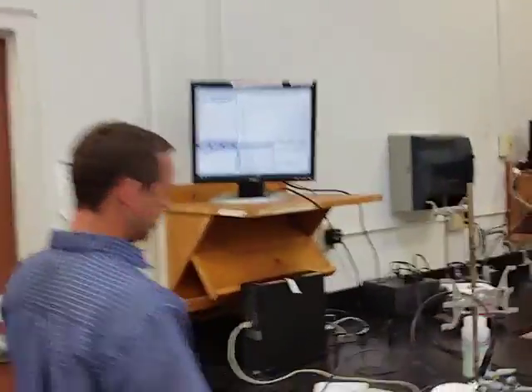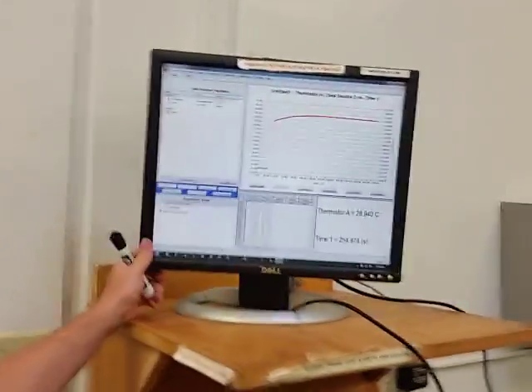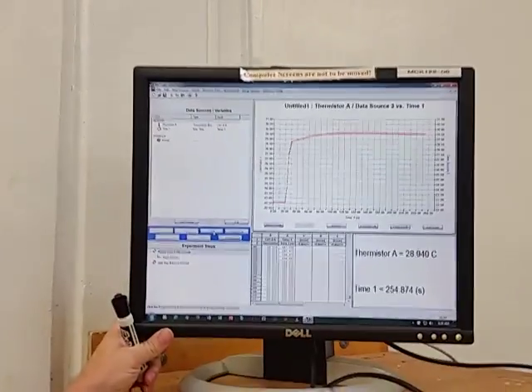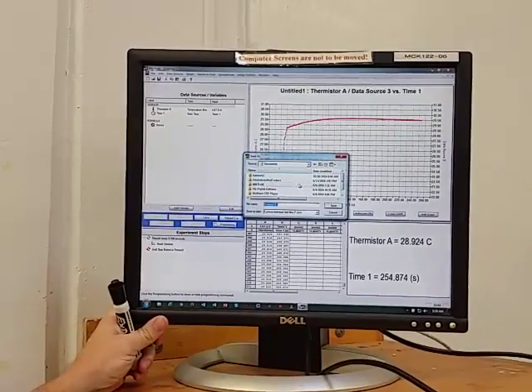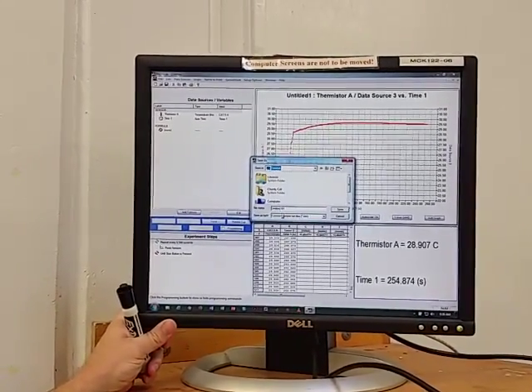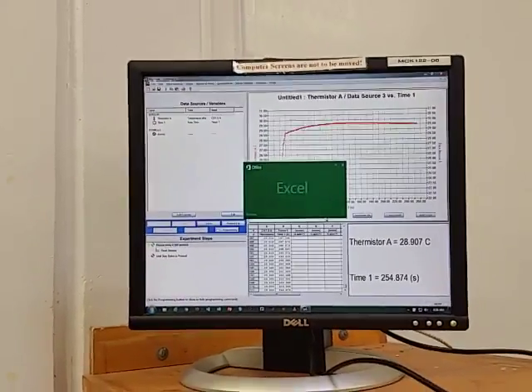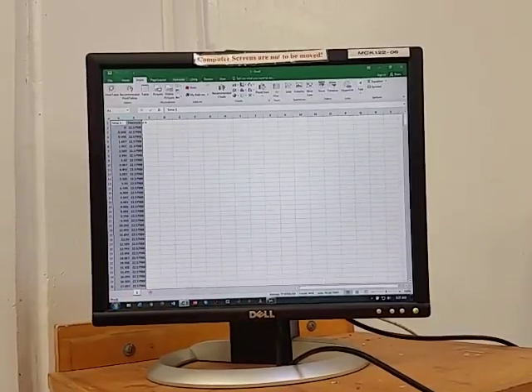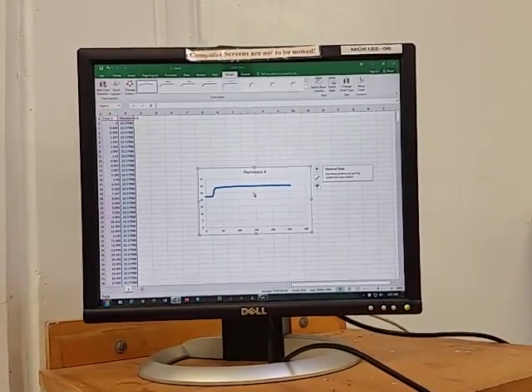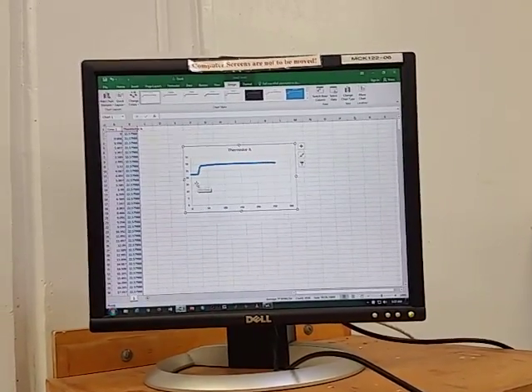Another thing that you want to do for your lab report is you want to be able to successfully export this lab or this data right here. To do that, we can say save, and we can say export data to an Excel file. Click that there. I'm going to save it on the desktop. I'm going to call it something that I can find quickly. And it's going to open it for me, and I can highlight it like that and then make a scatter plot, just like it was a second ago. There now, I have a table that I can put into the lab report.